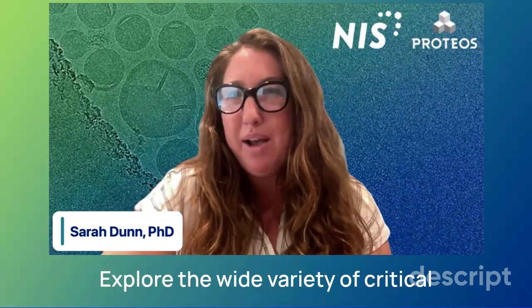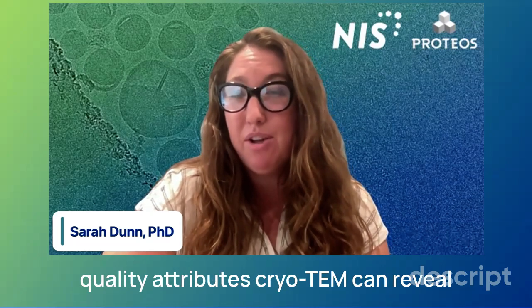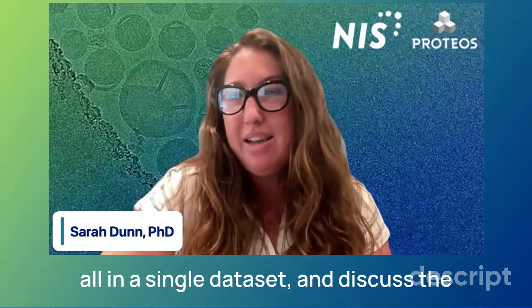We'll be reviewing the advantages of Cryo-TEM for imaging lipid nanoparticles in their near-native state, explore the wide variety of critical quality attributes Cryo-TEM can reveal, all in a single dataset, and discuss the applications of Cryo-TEM from R&D all the way to CMC and regulatory support.